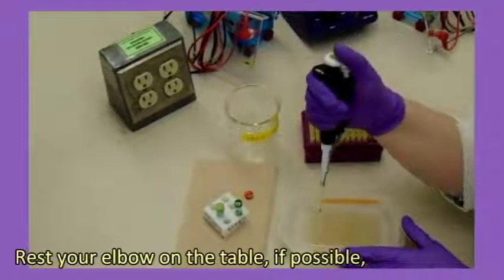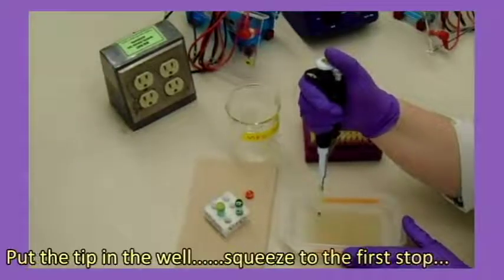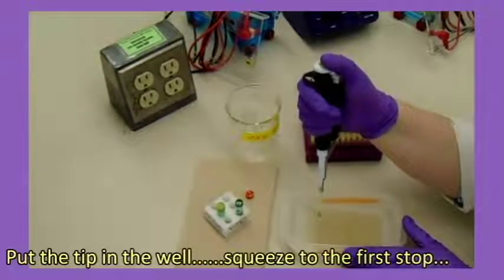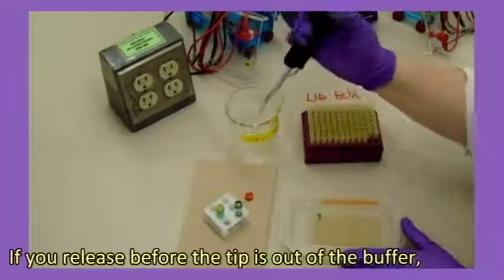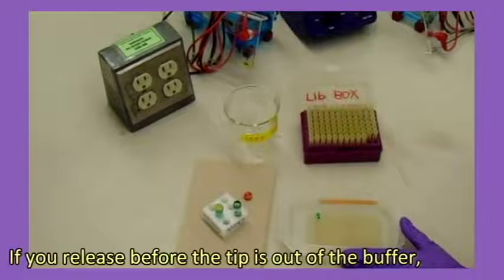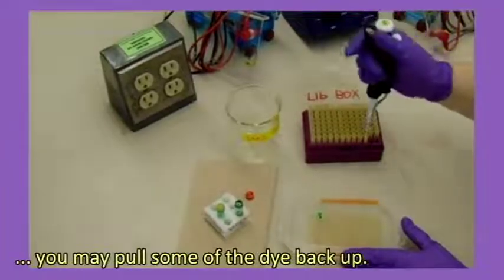Rest your elbow on the table, if possible, to keep your hands steady. Put the tip into the well. Squeeze to the first stop. Lift the tip out, then release the plunger. If you release before the tip is out of the buffer, you may pull some of the dye back up.